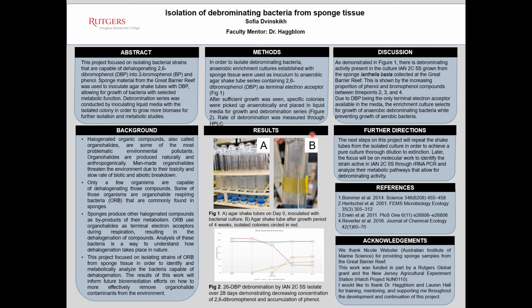1B on the right demonstrates the bacterial growth after the growth period of 4 weeks. The isolated colonies are circled in red and appear dark and round.